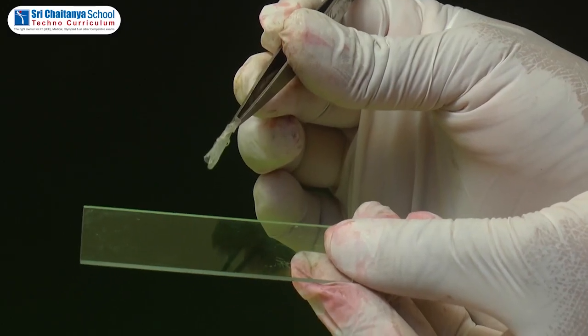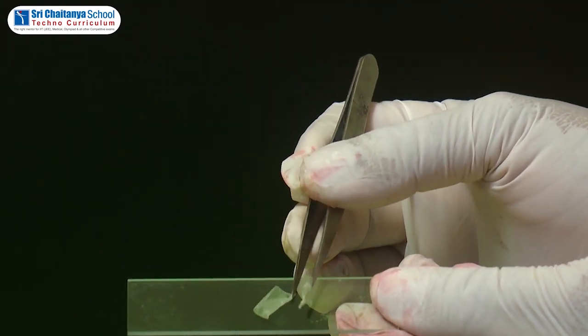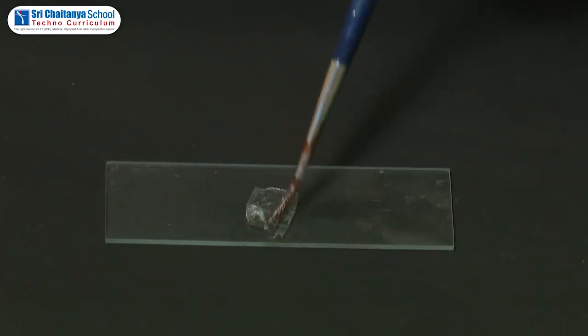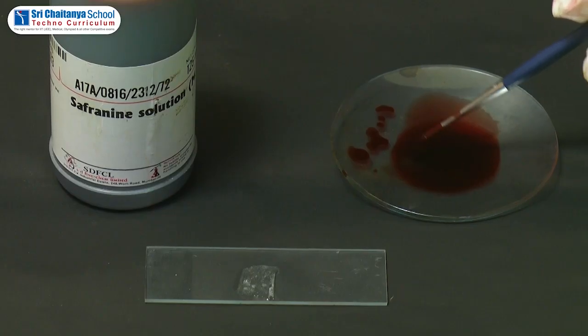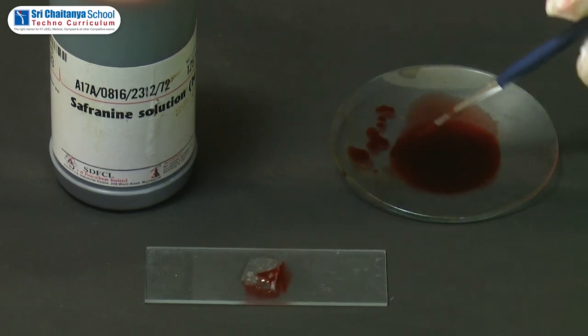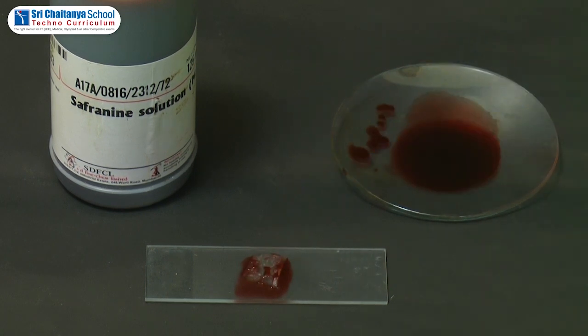Now the onion peel is placed on the glass slide. Put a drop of water on the onion peel, then stain it with safranine. The safranine is absorbed by the plant cell's cytoplasm.